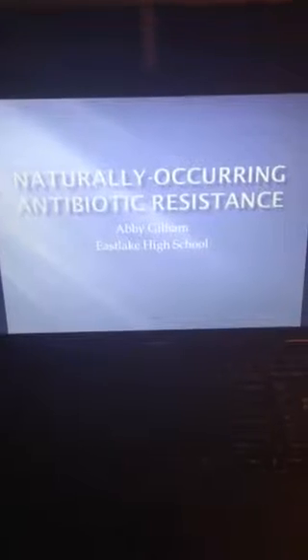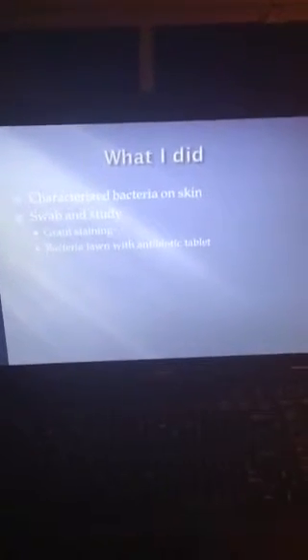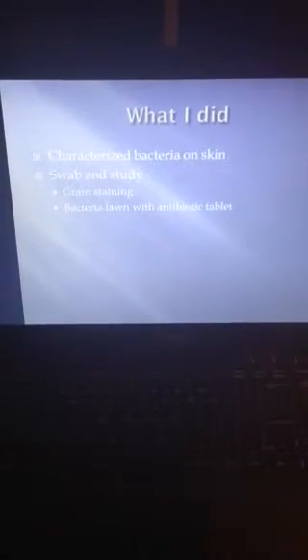I go to Eastlake High School, and for my Student Bio Expo project, I study naturally occurring antibiotic resistance. In my lab research, I characterized the bacteria found on human skin, inspired by research of the Microbiome Project. I did a much more basic version of what they're doing, and swabbed bacteria off the inside of my elbows and studied it through gram staining and a bacterial lawn with an antibiotic tablet. In this bacteria, I was looking for antibiotic resistance.